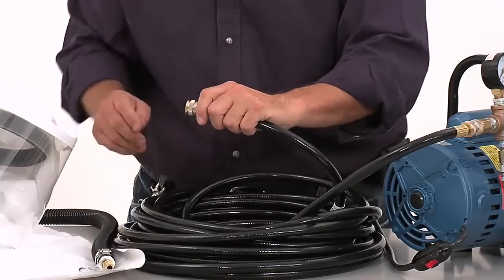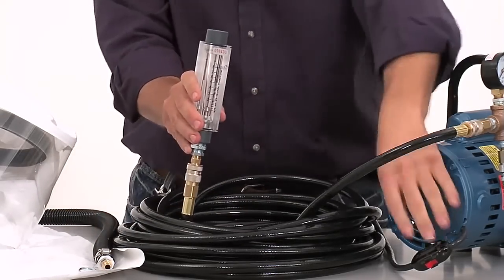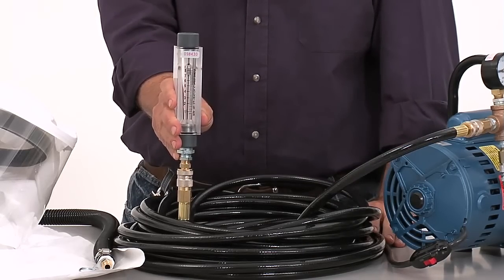You can check the output on your pump by using the Allegro flow test kit. Regular maintenance on the ambient air pump will extend the life of your air source.